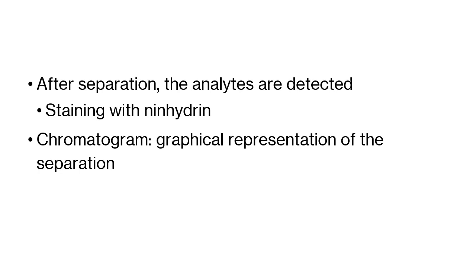As I said earlier in the previous post-lab discussion, ninhydrin is used in forensics, in the identification of fingerprints, so there is a caution in your procedure that you should wear gloves. Moving on, you have your chromatogram, which is a graphical representation of the separation of your samples.